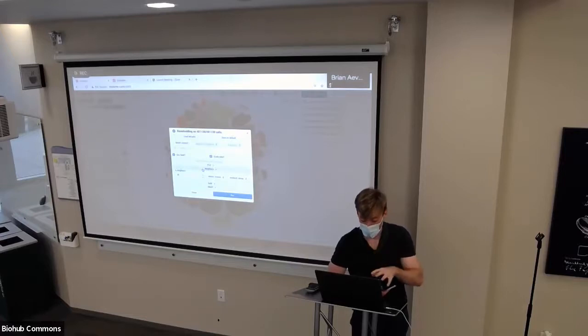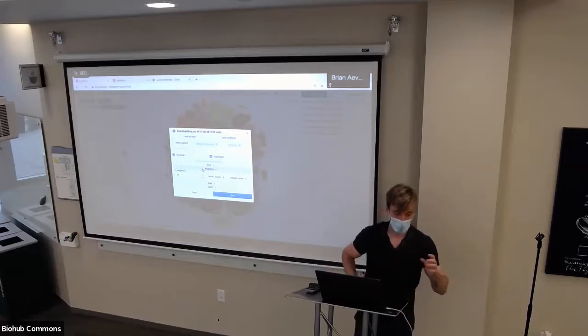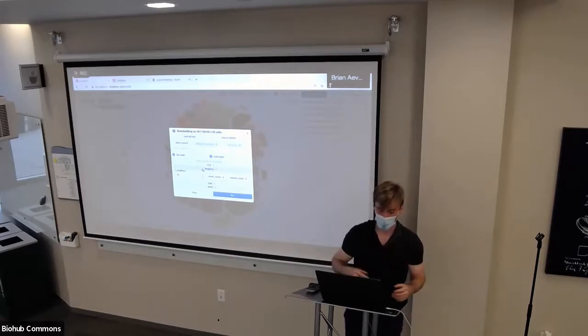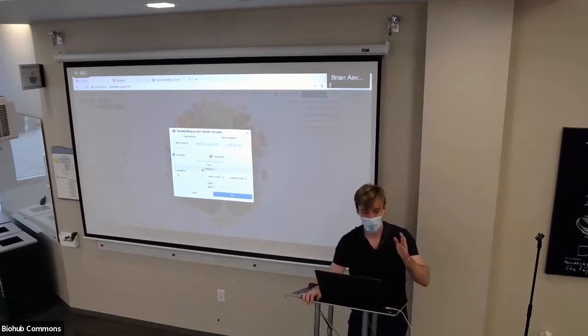Yeah, that's a great suggestion. First of all, to clarify, the nearest neighbor graph is between cells. So individual cells, if you tried plotting a 480,000 cell network in a 2D layout, it would suck. But what you can do, and what people in the Theis lab have done and incorporated into Scanpy, so it's really easy to pipe into this workflow, is PAGA, partition-based graph abstraction, where they basically coarsen the graph. They sum up all the edges coming out of all the cells in a particular cluster, then weight the edges in some intuitive way, maybe using a Gaussian distribution. Then they lay it out using a 2D layout algorithm, and then they take all the individual cells and have a heuristic for mapping them onto the coarse layout.